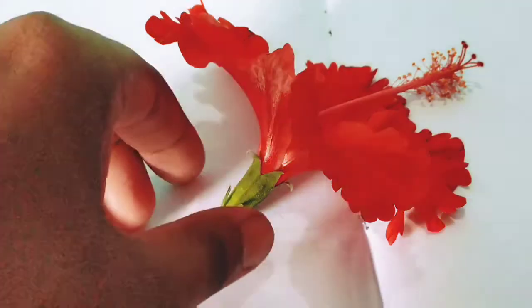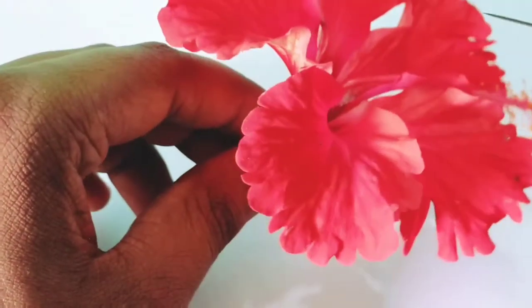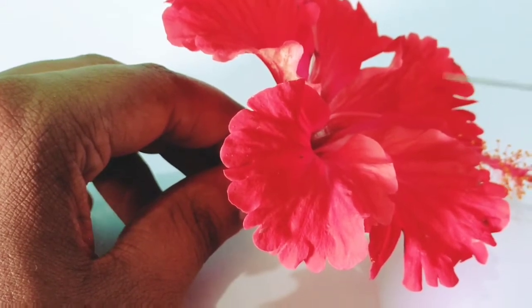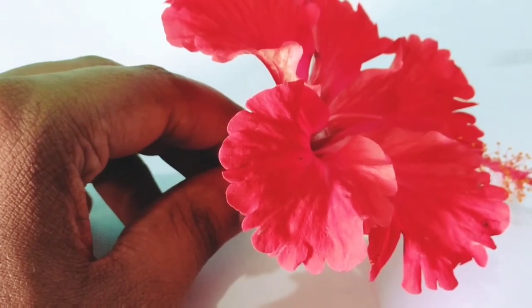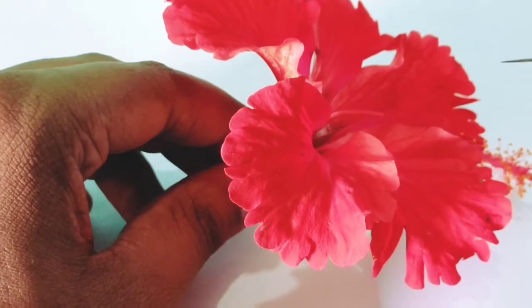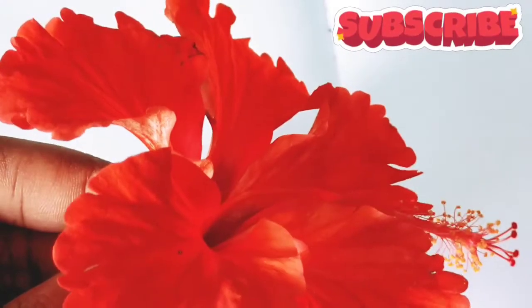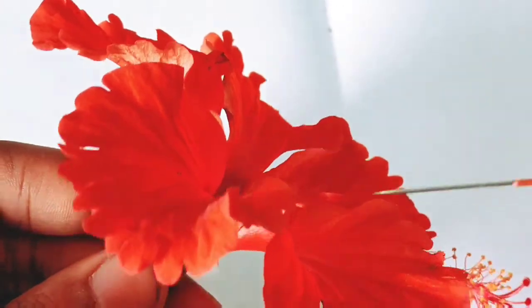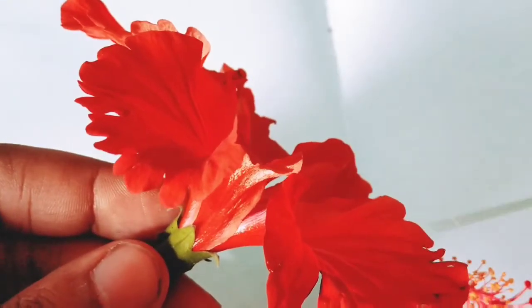First of all, we should know about the specimen. Today we have the China rose as our specimen, so let's know about it. The scientific name of the China rose is Hibiscus rosa-sinensis. First of all, we should know about the whole flower.